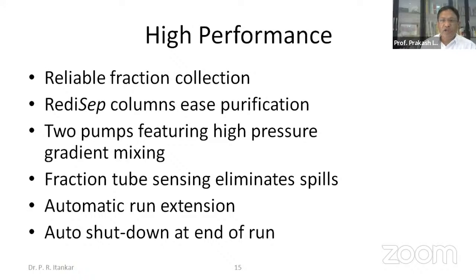That reliability of fraction collection, separating fractions with constituent A from the other fractions where some other constituent is present, needs to be done smartly by the machine. That is our need, so reliable fraction collection is an important thing.